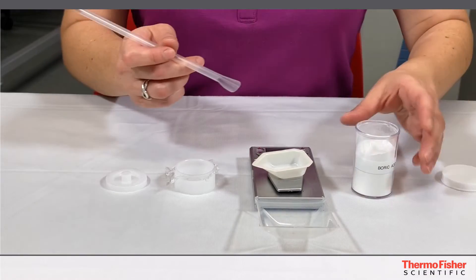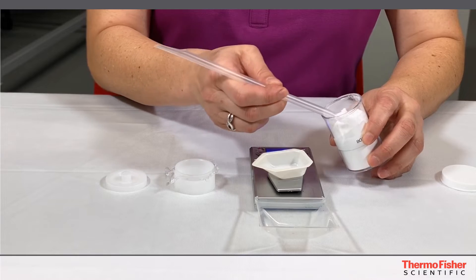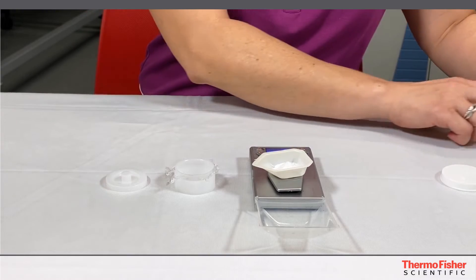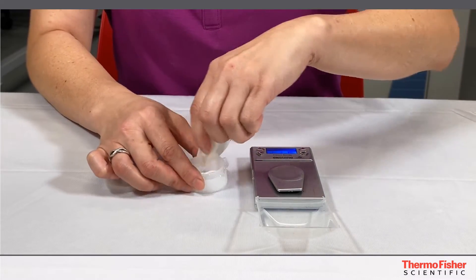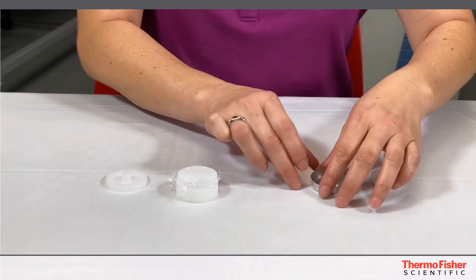It is important that you weigh your loose powder. We're using boric acid here as a representative powder. You don't need that much, maybe about less than a gram or so. Notice Ton's got a disposable slurpee straw there. Once you pour it in, tap it down, and then we're going to show you how to basically sandwich it down.